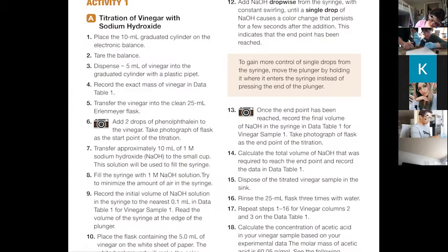So is the third sample the only one where we use a different vinegar? I think you do 3 of each one. That was my understanding. 3 for the vinegar sample that was included in the kit, and then 3 for an unknown, one you have in the kitchen.